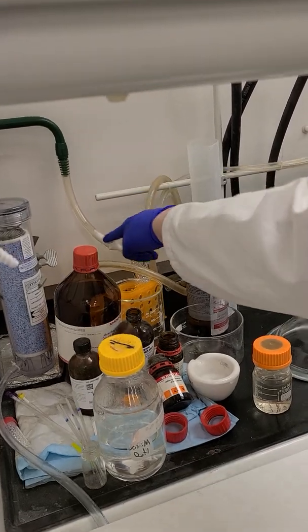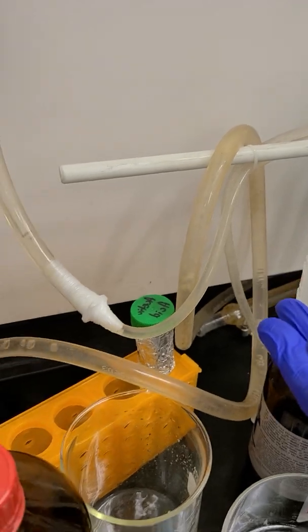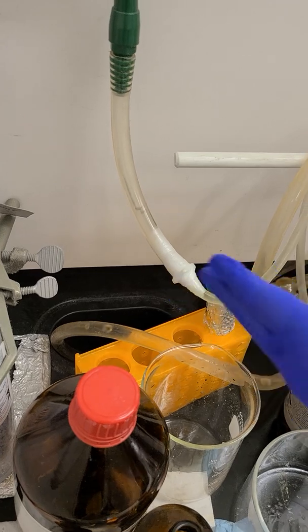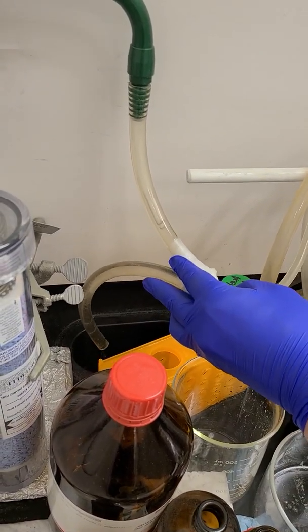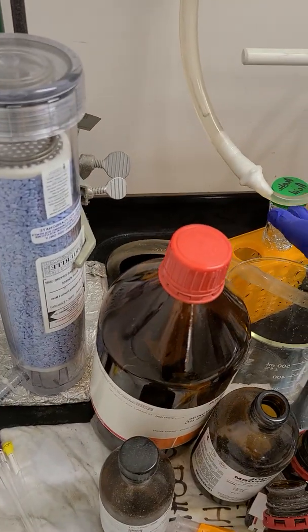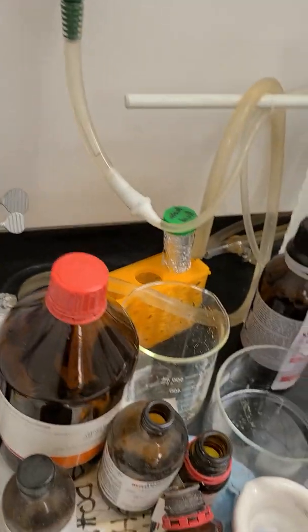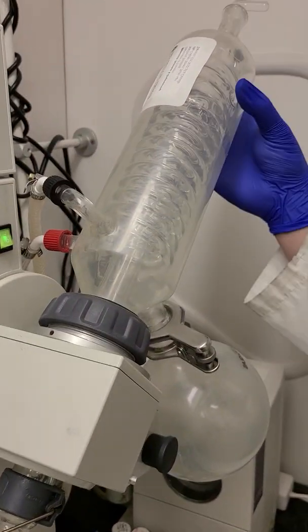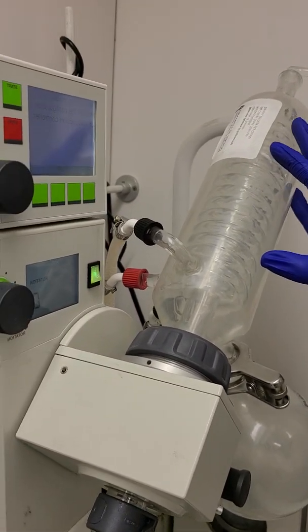And you can see the little bubbles running. So that indicates obviously water flow. And just make sure that the water is in fact draining into the sink. If the pressure is too high, the outlet tube might spray somewhere else. And so you just got to make sure that the water flow is such that you're not getting leaking here and you're not spilling and flooding here. The cold water on the column is what allows for more volatile solvents to actually condense in here.